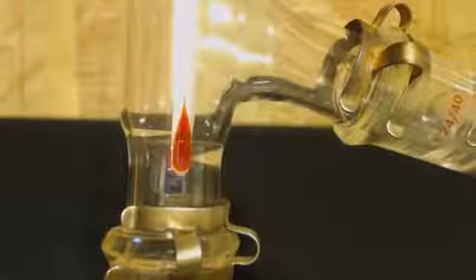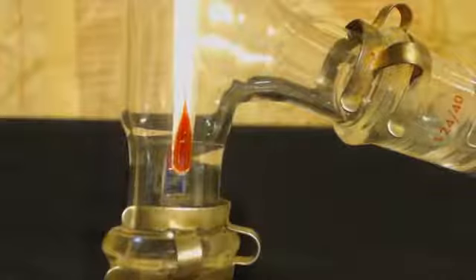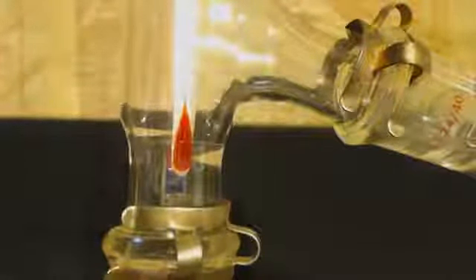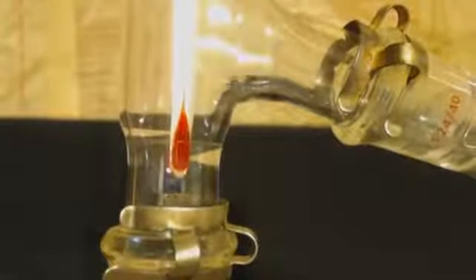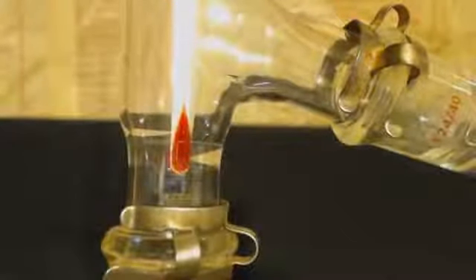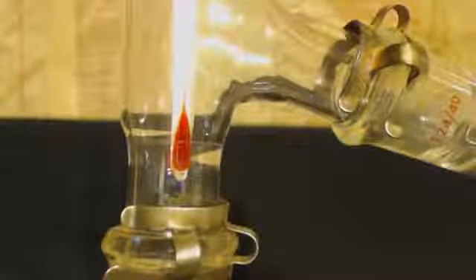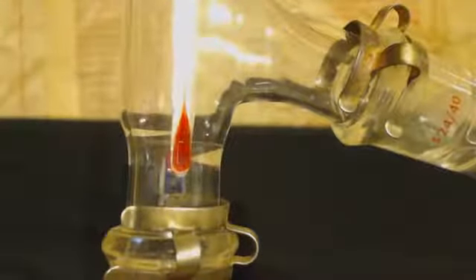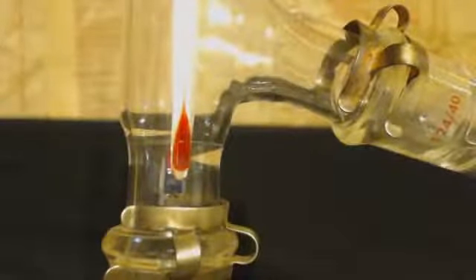And here I'm going to show you. I'm just using the stir bar to turn the stir bar up and down to get this thing to go up and down. But watch this front. It's coming right up there. Now as soon as it hits right here, that's exactly where it should be. And you should have it no further than that. I have it going up because I'm doing the camera, so I went too far. But you want it to just pour in like you're pouring something, just barely pouring it over that neck there.